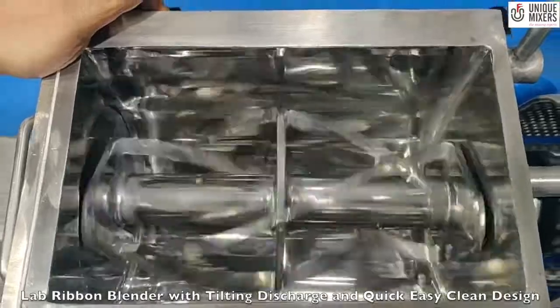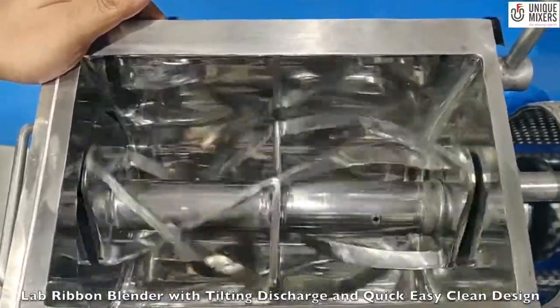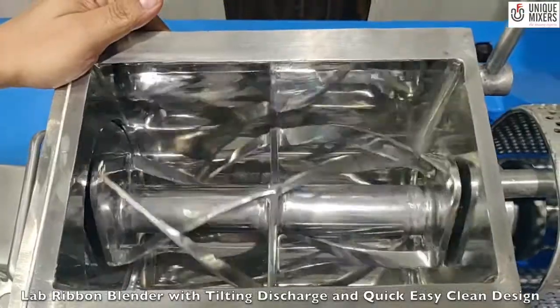Mixing can be achieved in quick time, less than 5 minutes, especially for dry powders. We should be able to achieve a homogenous blend with a homogeneity of about 97-98%.